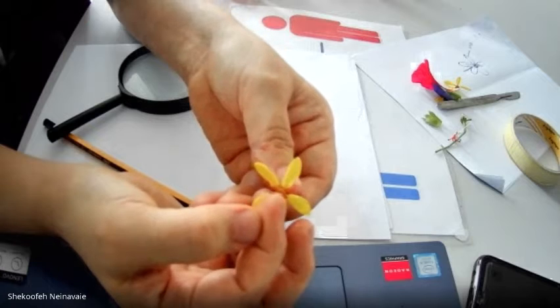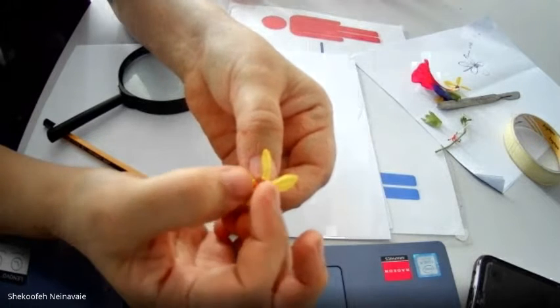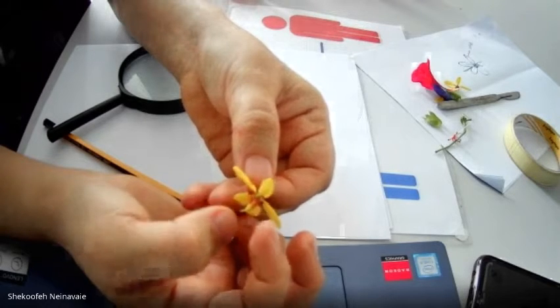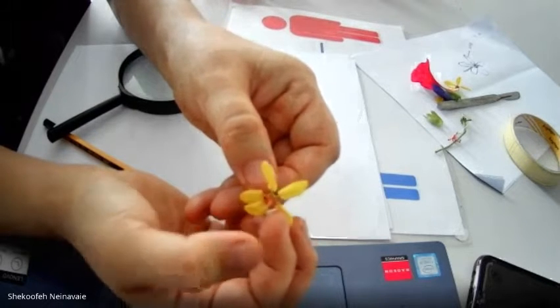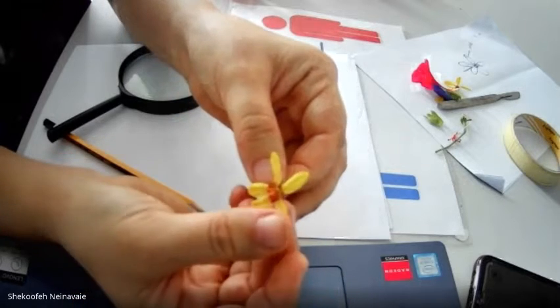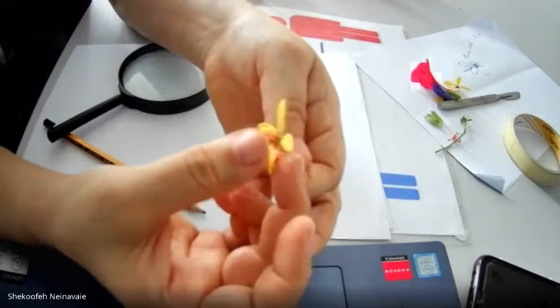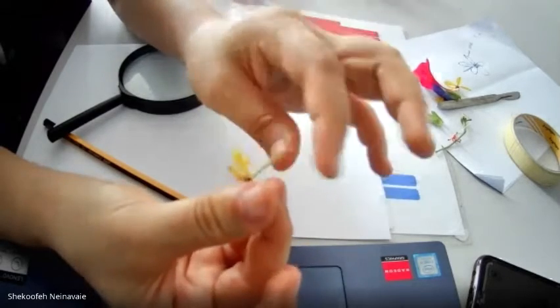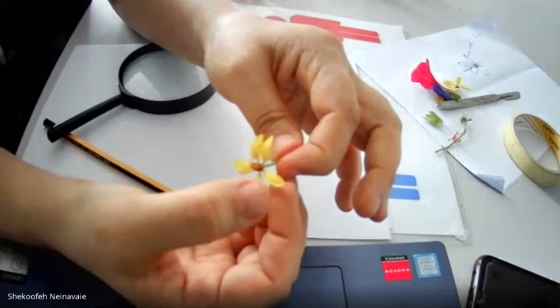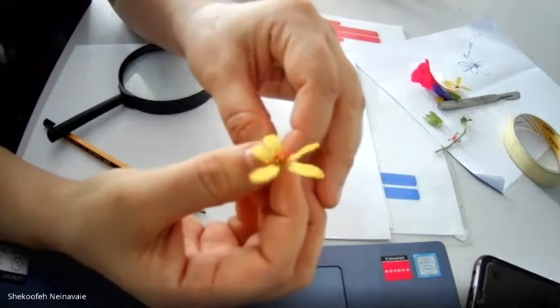The style is a long tube or sometimes a shorter tube, depending on the type of pollination, for example, if pollen from the same flower falls on the female of the same flower, or if pollen from other flowers needs to be carried to it. If it has very shiny, bright, colorful petals, it means that it needs insects to be attracted for pollination. So insects come and sit on the pollen, and the pollen gets attached to the body, the wings or the legs, and is then carried to the other plant or the same plant. So they can place it on the female of the same plant or another.